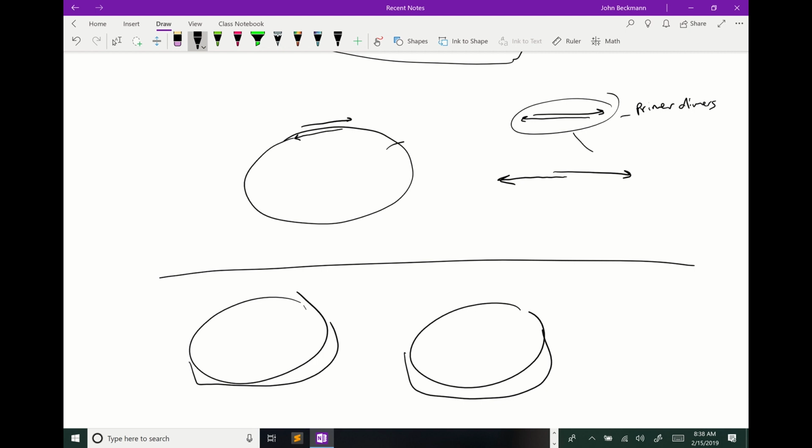And what you'll notice is, if these are plates, let's say this is an amp, we're doing a Quickchange on an ampicillin plasmid, and we need to select and get rid of our template. If you do the DpnI for 1 hour versus overnight, this one is going to have far fewer colonies, and this one is going to have a lot more.